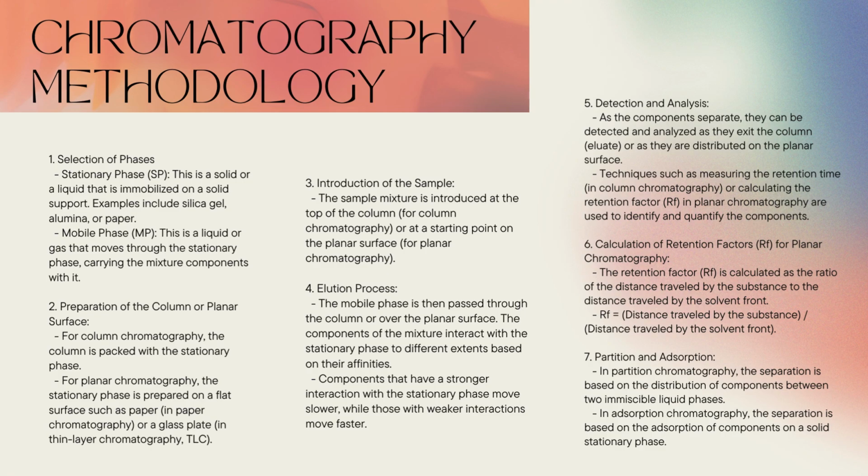Moving forward is the detection and analysis. As the components separate, they can be detected and analyzed as they exit the column, the eluate, or as they are distributed on the planar surface. Techniques such as measuring the retention time in column chromatography or calculating the retention factor, Rf, in planar chromatography are used to identify and quantify the components.